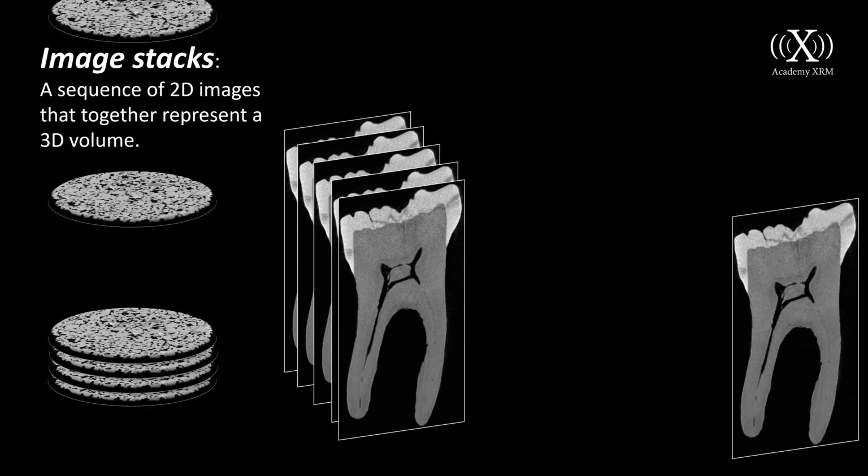Let's get started. I have a micro CT scan of a tooth with a voxel resolution of 15.9 microns, and it is saved as a bitmap image stack. To load the data, I can either click the data button in the toolbar here, or use the add data button in the welcome module. In the window that pops up, we can either choose a directory to add or select files. I usually prefer selecting the entire folder, navigating to my dataset and clicking select folder.